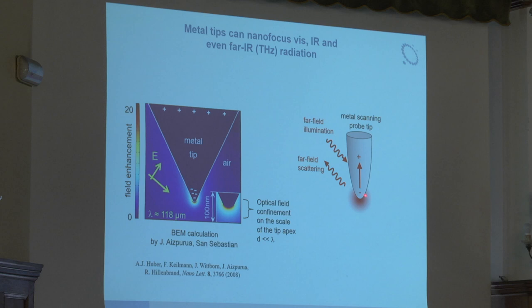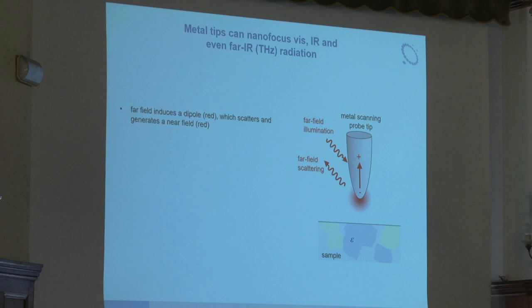This near field is just hanging around here. It's not really doing anything. Yeah? It's just there. And then this dipole scatters, right? So that's what happens. So this near field, you wouldn't normally notice. But now we bring the sample close, and if you are a certain distance away, nothing happens. The near field does not reach the sample.